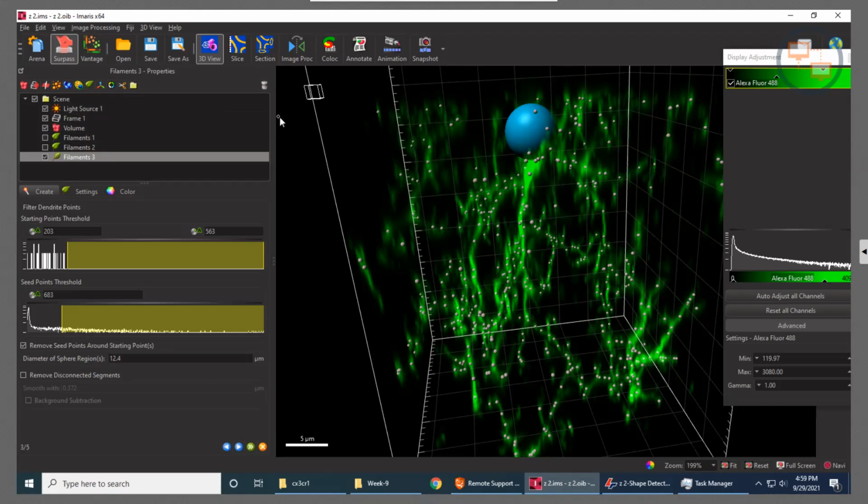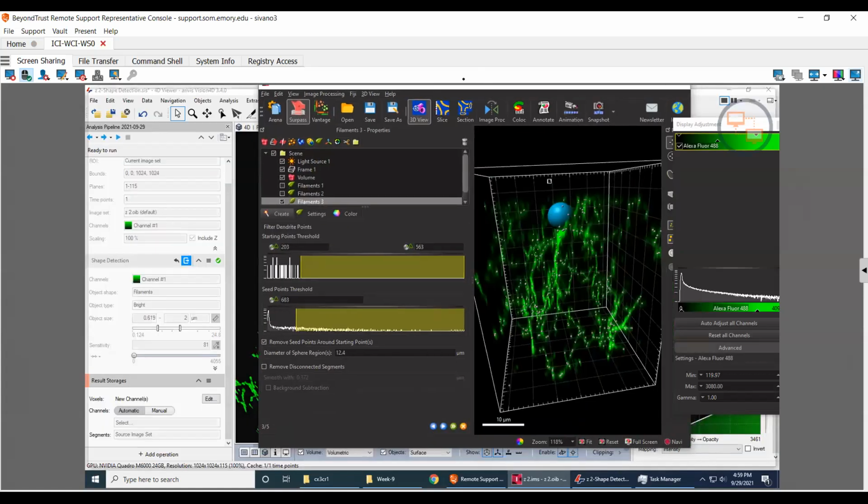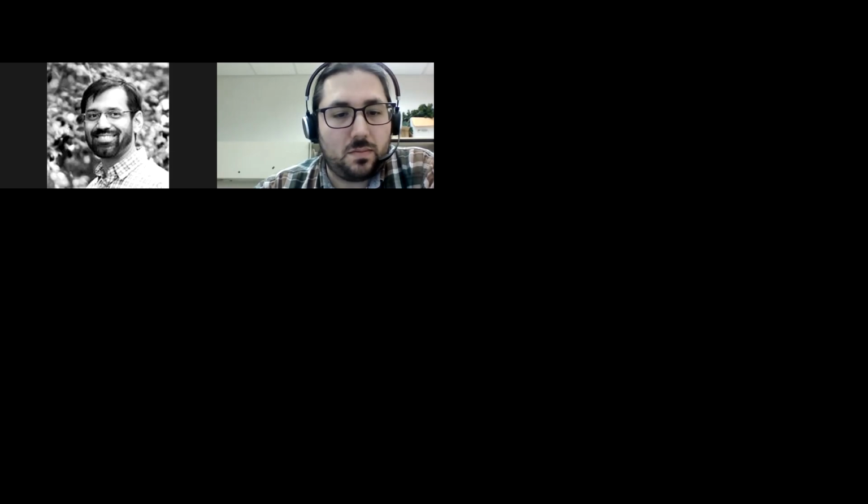And Gabby, out of curiosity, I'm sure your data set is from neurons, but in that situation, when you are imaging, is that at the best Nyquist sampling? Because that is important, right? For example, the data set that Stoyan is working on right now is at the best Nyquist sampling. And that's why every single fluorescent source, or fluorescent voxel, is connected to each other.